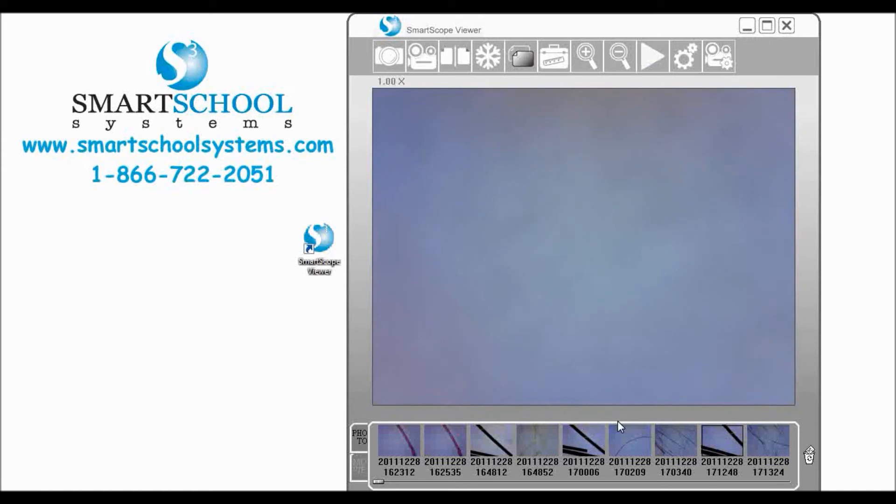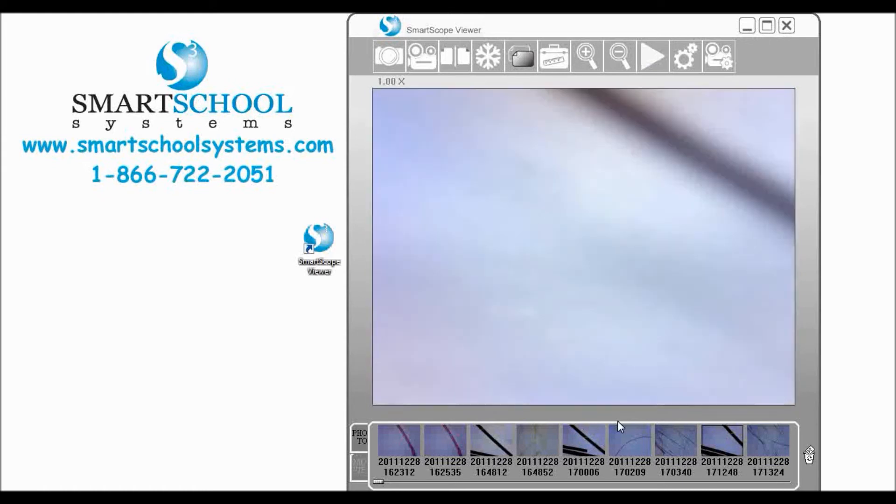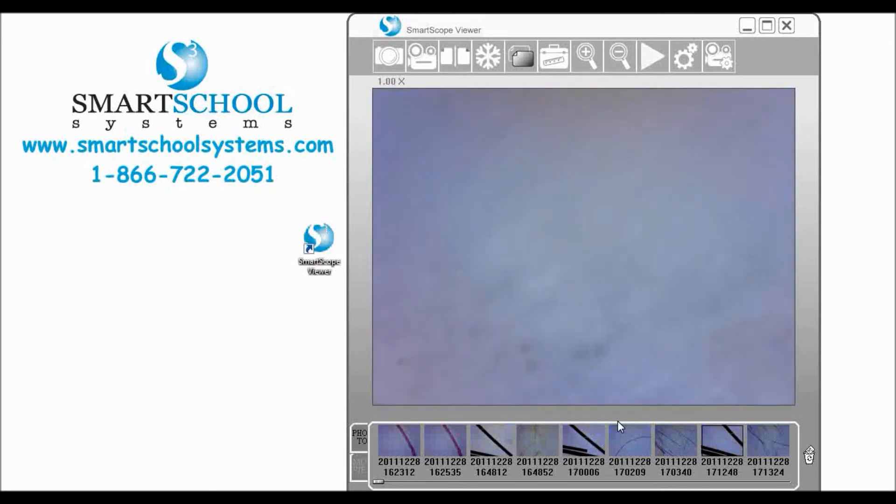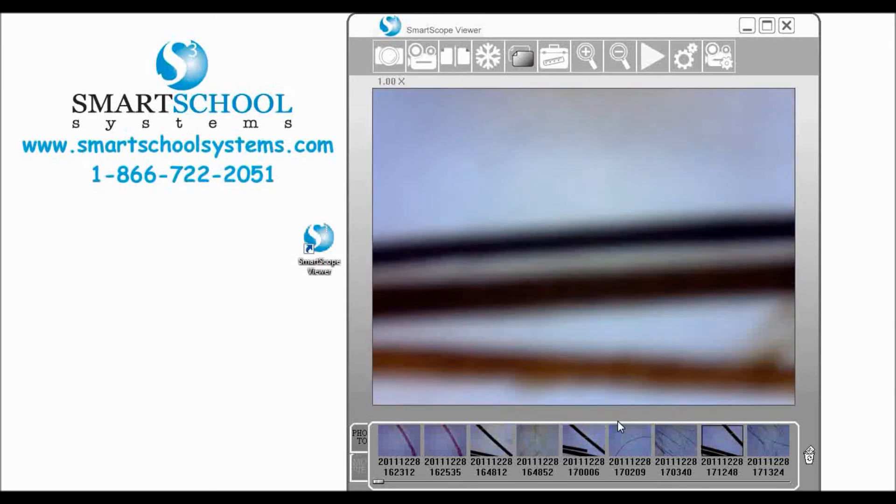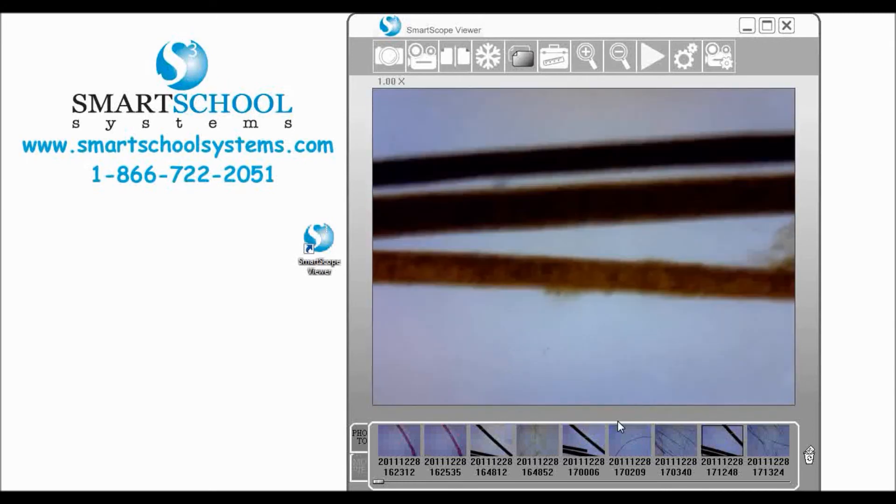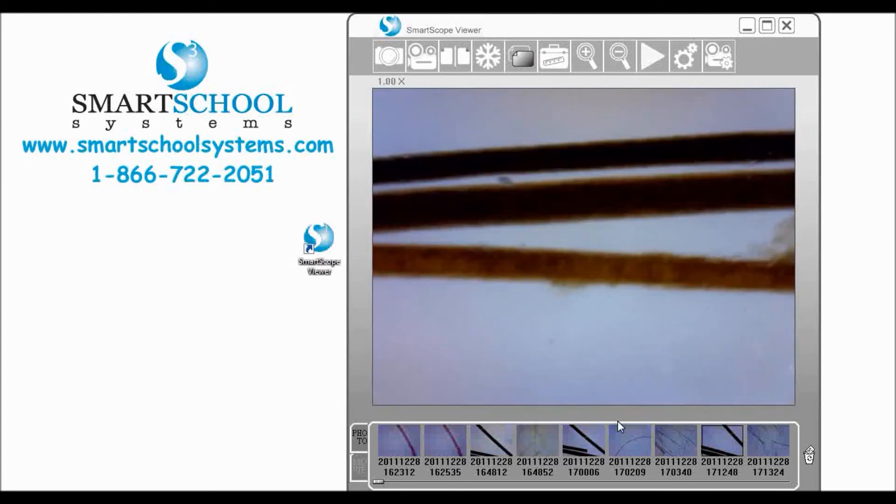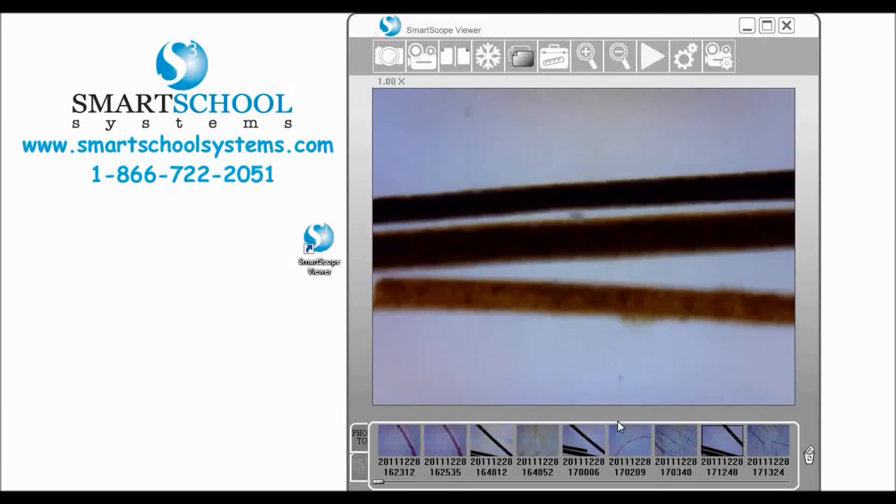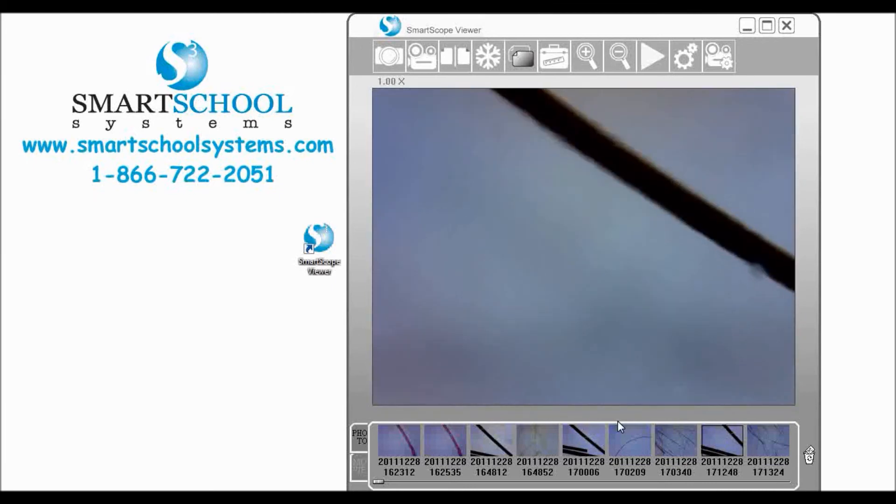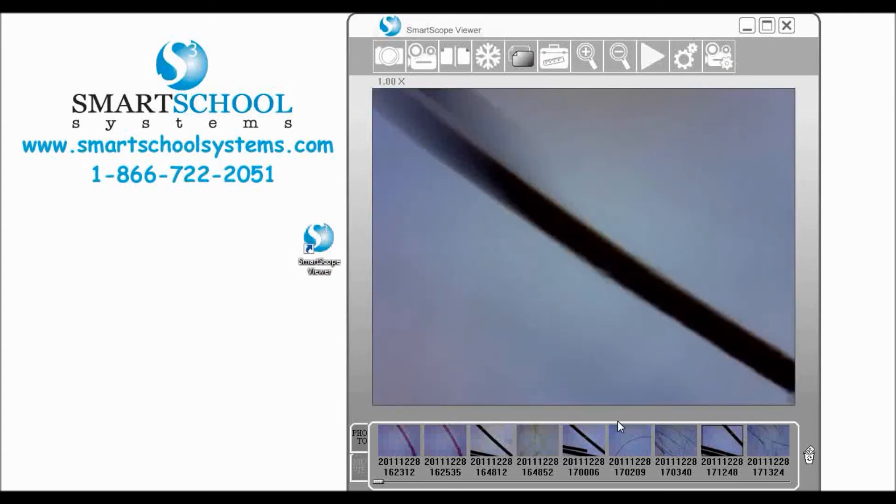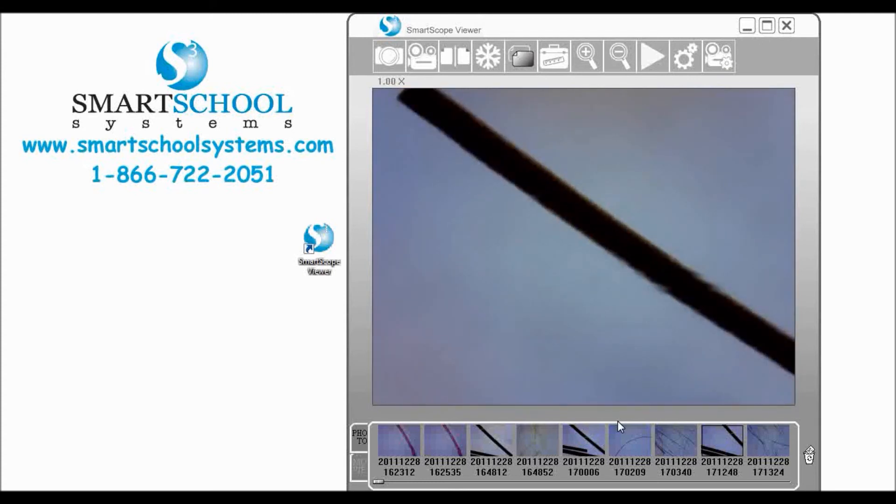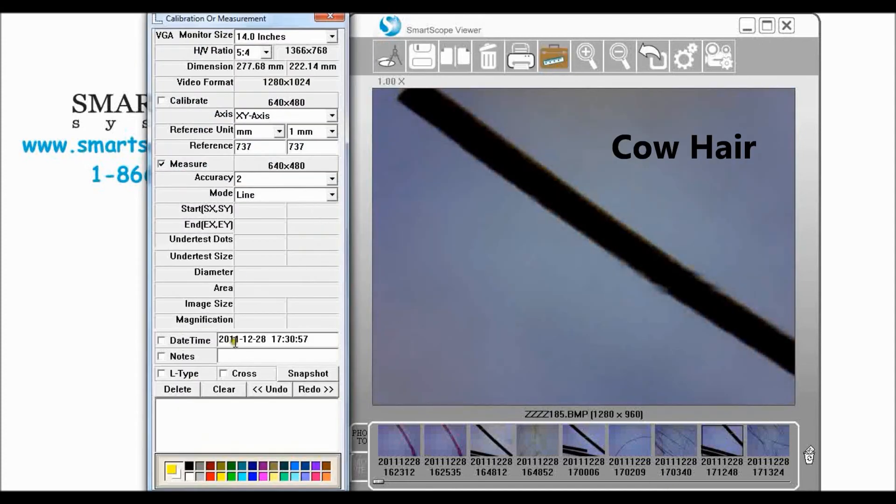Be careful not to move your SmartScope or change the focus because it will affect the measurement. I'm going to adjust our focus just a little bit just to make sure that we get a good edge on that. What we're looking at here is cow hair and so I've got it lined up.